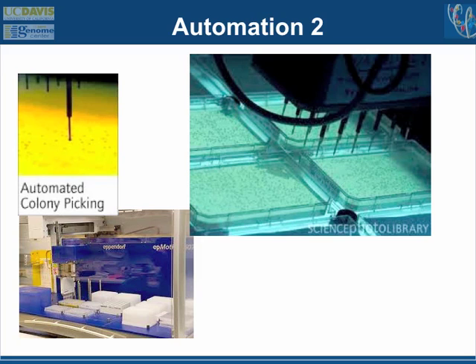So again, I worked at the Institute for Genomic Research. We had 100 plus of these machines. Each one cost $700,000 or something to that effect. And each one could read originally 96 sequences at a time. It had 96 little tubes, and then 384 sequences at a time. And you had to have a different plasmid prep for each one of the sequences that you were running on this machine, and a different DNA prep of those plasmids for each of these reactions.